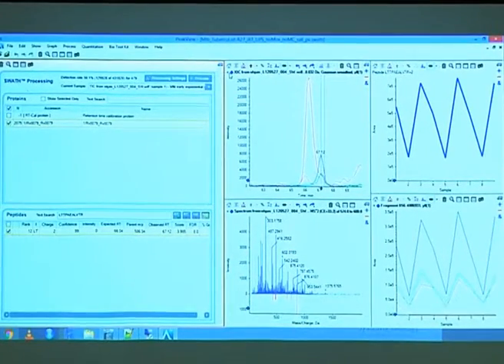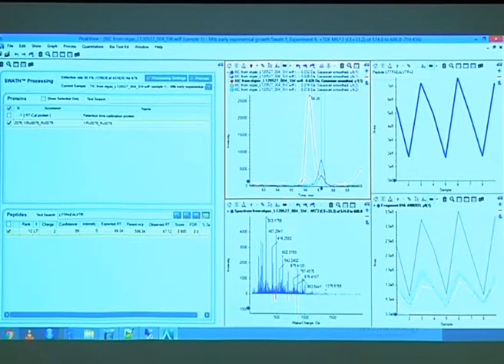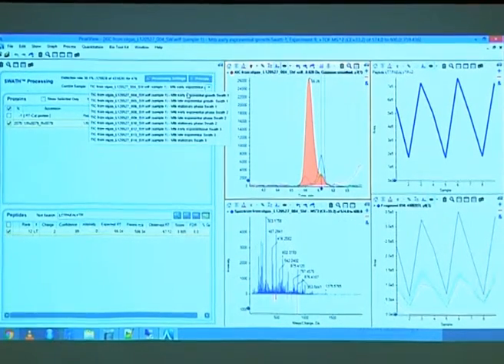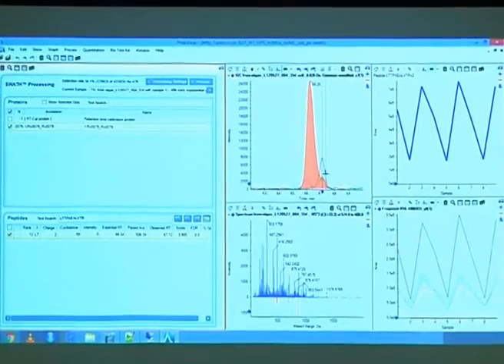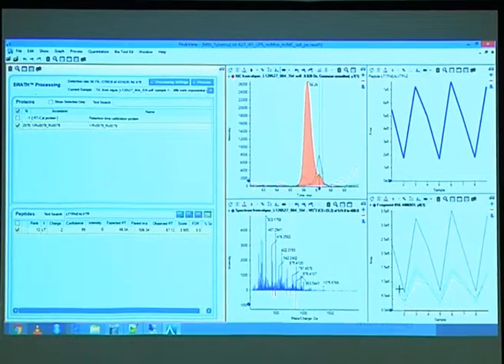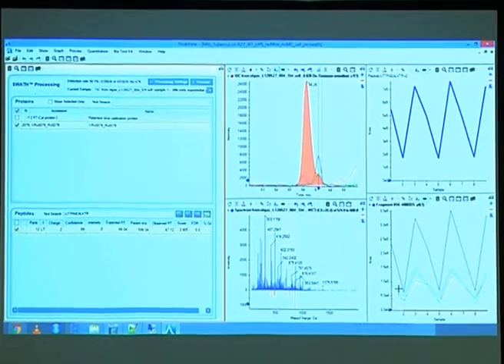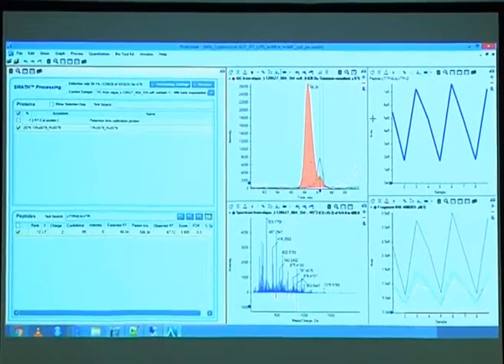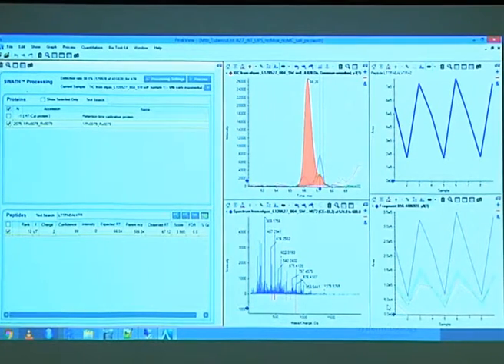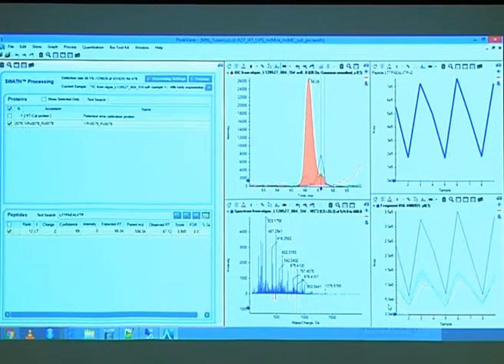What happened there is, I think in this case it actually split. No. Oh, because I didn't change. No, I did change. So in this case, it still added some intensity to the peak group. In the other ones, it excluded it because it considered it as an interference, and that's something PQ does as well. If there is an interference, it will remove the ion and not export the area.